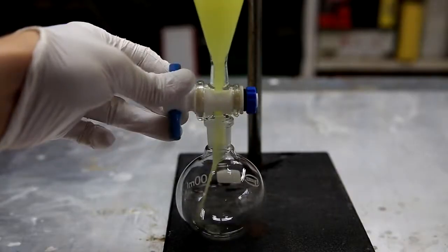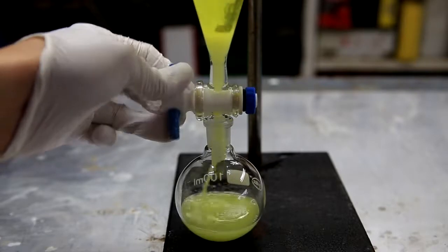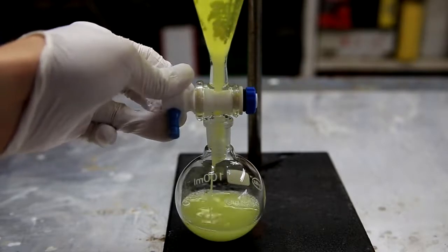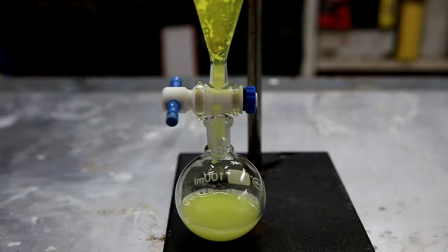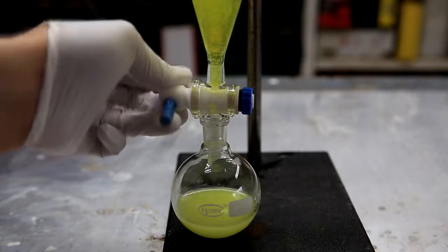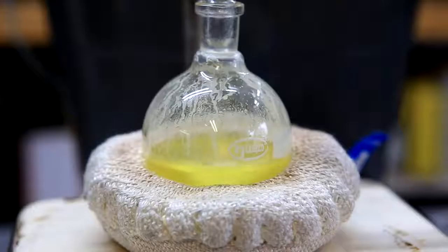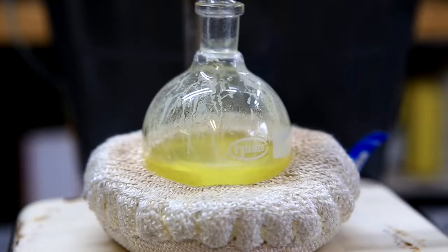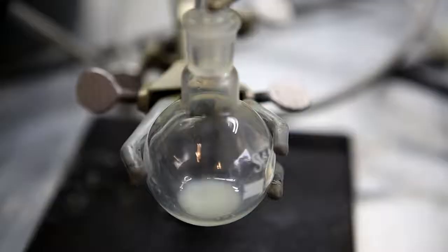After the final washing, the nitrobenzene is transferred to a round bottom flask, and due to the presence of water, you can see that the solution is quite opaque. To further purify the nitrobenzene of water and of the di and trinitrated product, we're going to carry out a simple distillation. The fraction that started coming over at around 208 degrees Celsius was collected. For safety reasons, do not let the distillation flask get any hotter than 214 degrees Celsius.